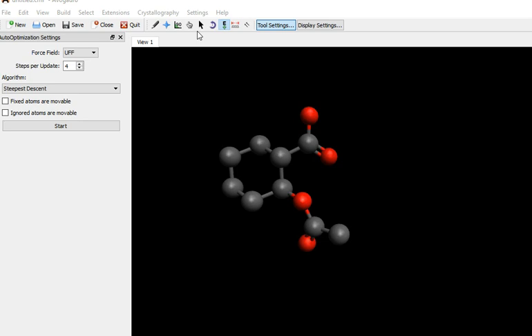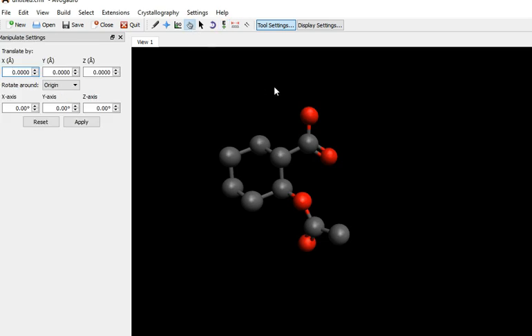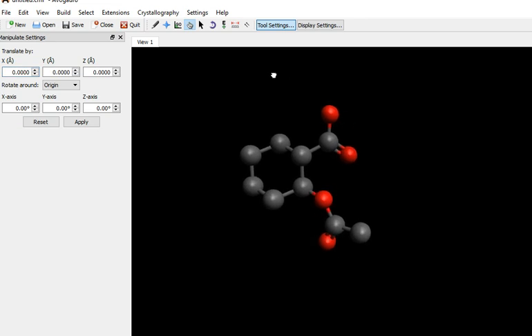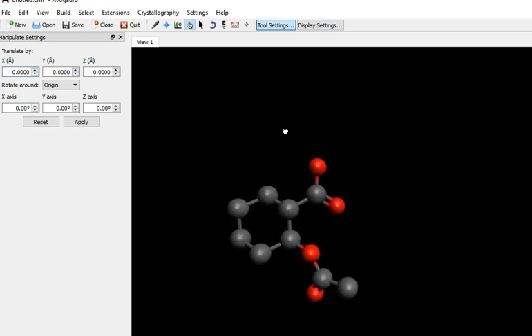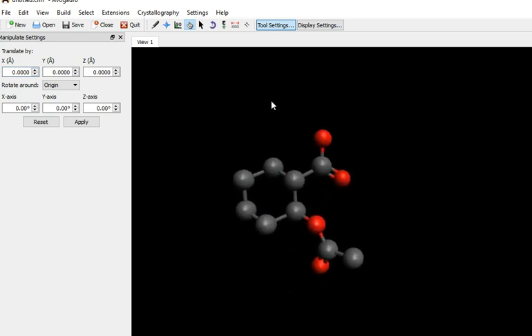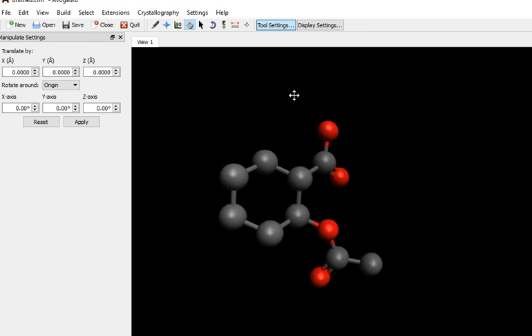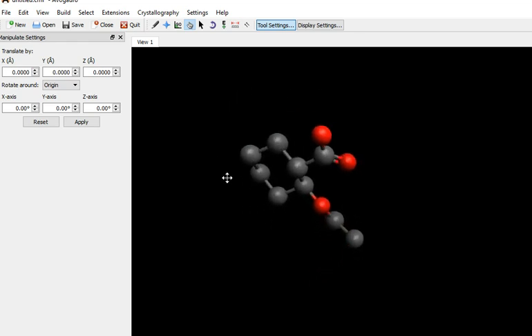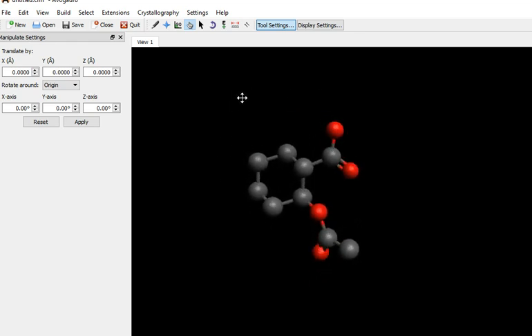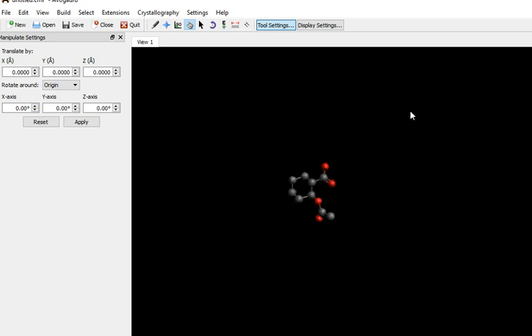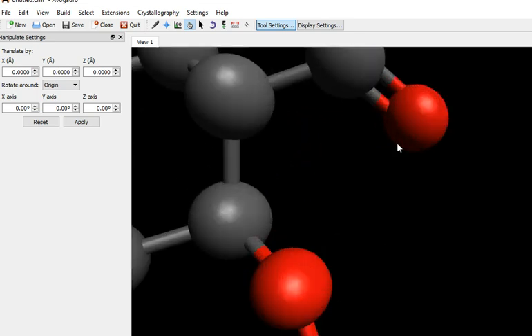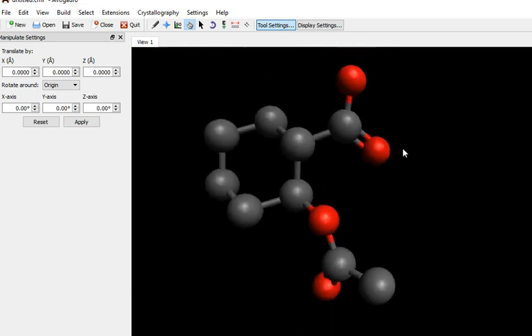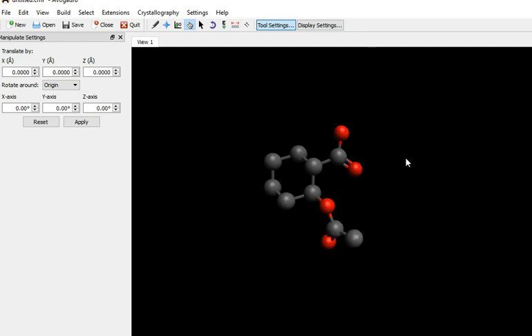So, selecting here will manipulate the molecule. Right click will move it around wholesale. Left click will rotate. And the middle, the scroll wheel, will zoom in and out. Whoa! Okay, so playtime over.